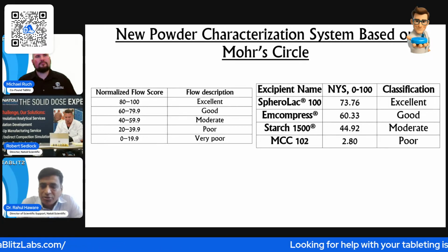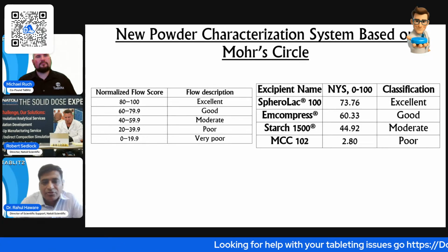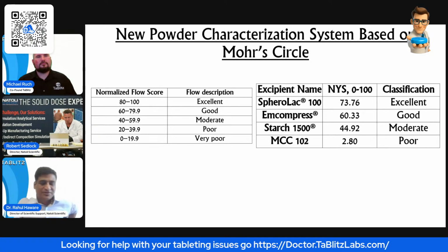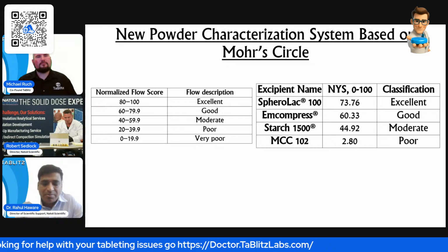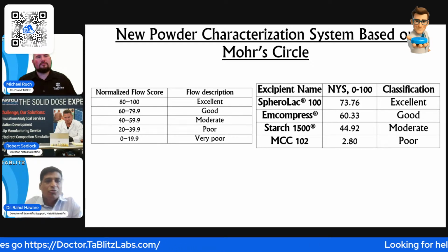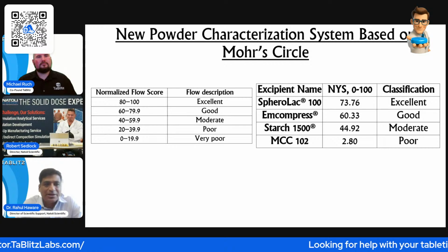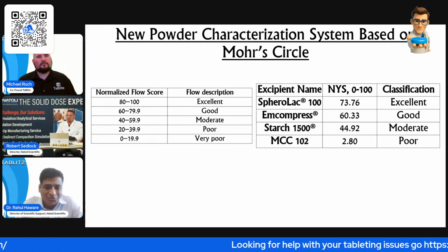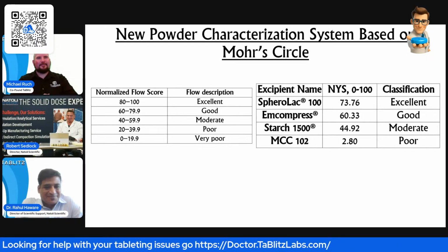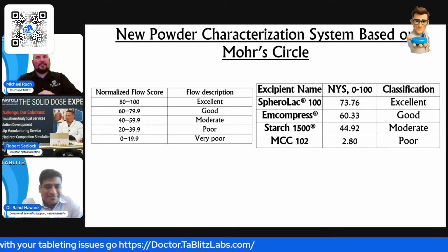And then at Natoli Scientific, we came up with a new technology for a sticking index, because when you are in the late phase of your development, you cannot change your formulation. So whom do you want to blame? Well, you want to blame everything on tools. The punches, right? Yeah, we're going to have an actual episode dedicated to this because this is such a hot topic all the time.